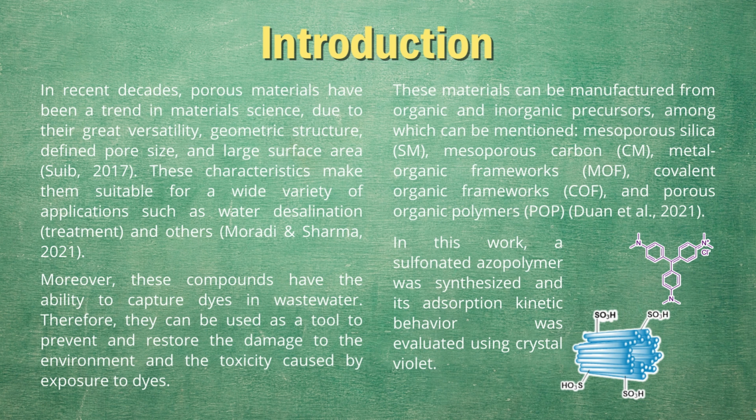These materials can be manufactured from organic and inorganic precursors, among which can be mentioned mesoporous silica, mesoporous carbon, metal organic frameworks, covalent organic frameworks, and porous organic polymers. In this work, a sulphonated azopolymer was synthesized and its adsorption kinetic behavior was evaluated using crystal violet.